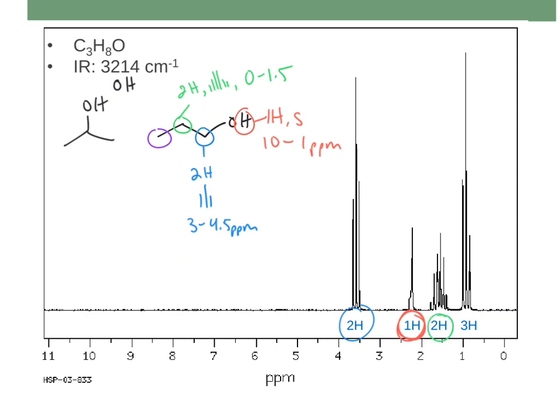So that's almost certainly this one, the complicated pattern, 1, 2, 3, 4, 5, 6. And then lastly, the 3H all the way to the right, better match here. This should be a 3H peak. It should be a triplet because it only has 2 neighbors, and again, between 0 and 1.5 ppm. So these all match up too. This NMR confirms that structure.